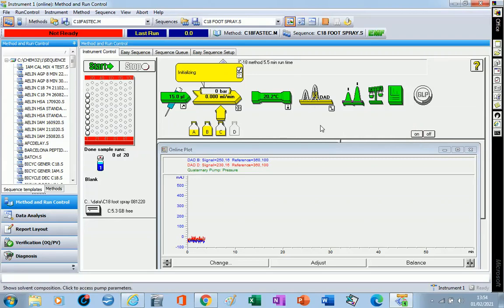To get ready for the analysis, we have to know which solvent we are starting with. My solvent C is usually the buffer, and B is the acetonitrile. Solvent A is also a buffer, a pH 2 buffer. I use a pH 7.4 buffer in solvent bottle C, and in D I usually use a high pH solvent because I measure lipophilicity and retention time using various pHs and gradient systems. So you can see and you can hear my pump started to pump this.